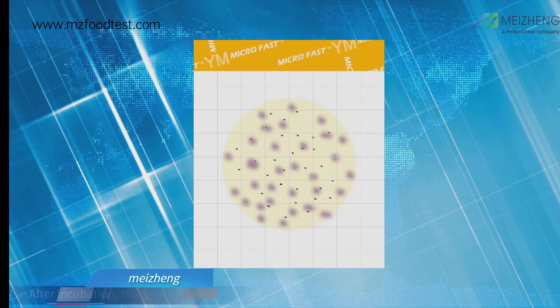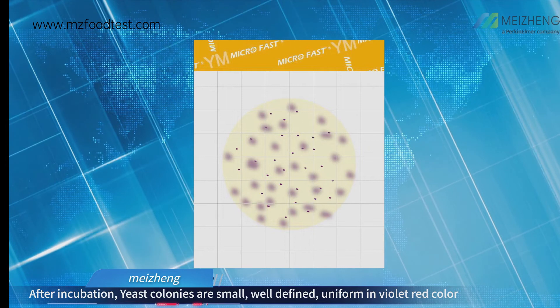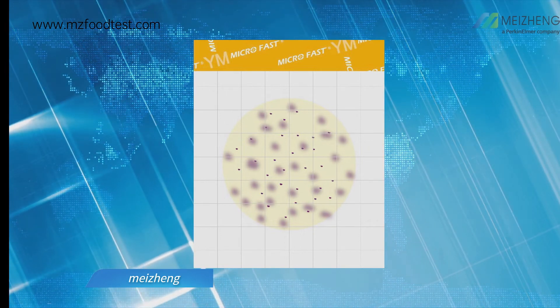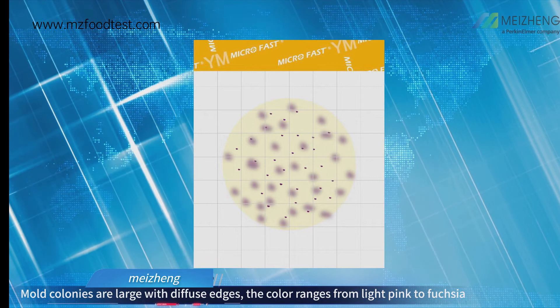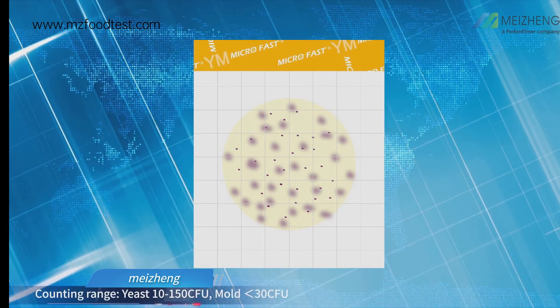Interpretation: After incubation, yeast colonies are small, well-defined, and uniform in violet-red color. Mold colonies are large with diffuse edges. The color ranges from light pink to fuchsia.